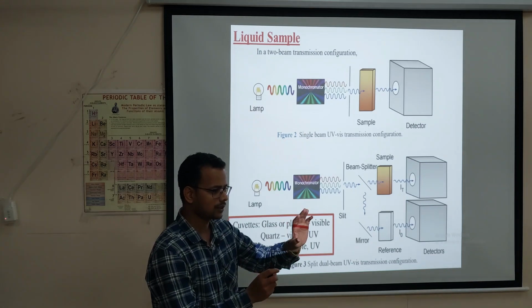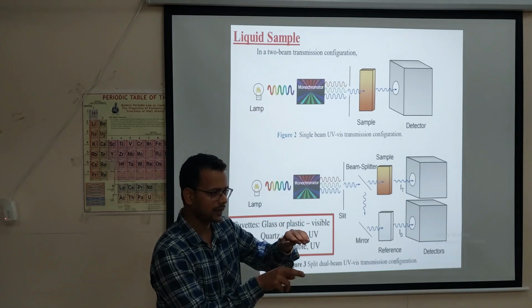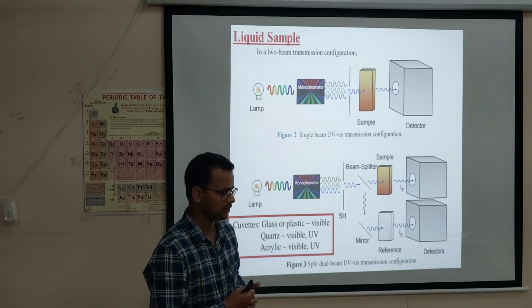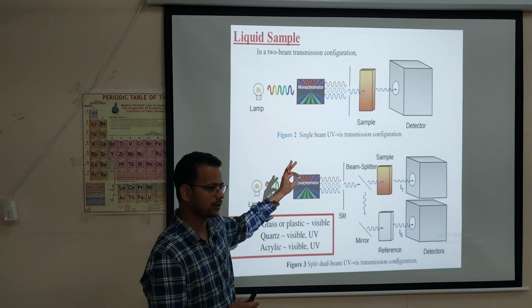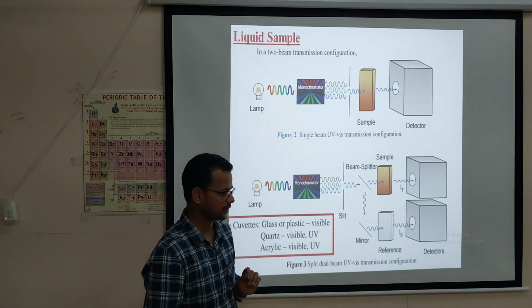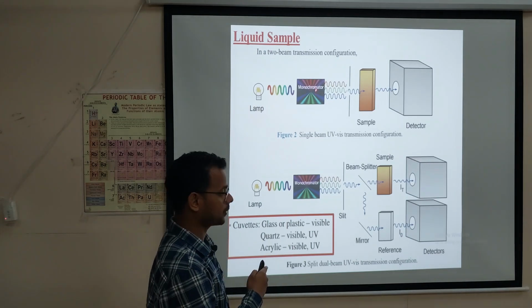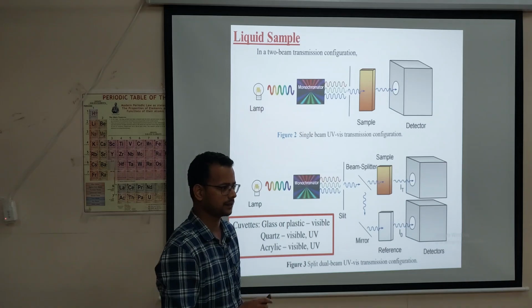In the monochromator, there is a prism. When visible light passes through the prism, it separates into 7 colors. The monochromator does this; it separates different wavelengths of light. This is the role of the monochromator, and it is very important. Clear? What is the role of the monochromator? It will separate the different wavelengths of light.